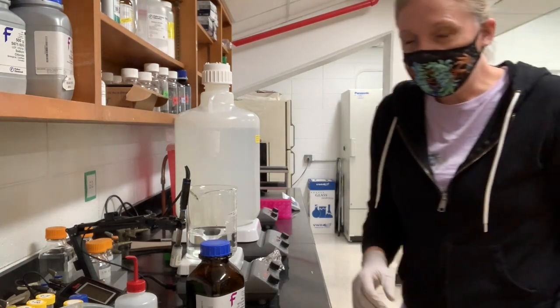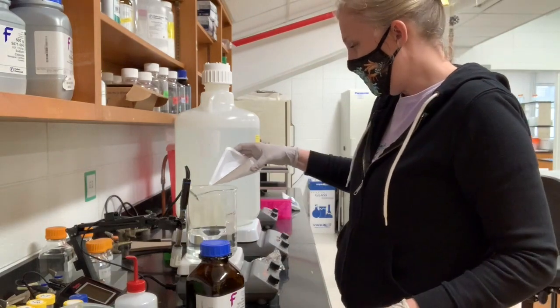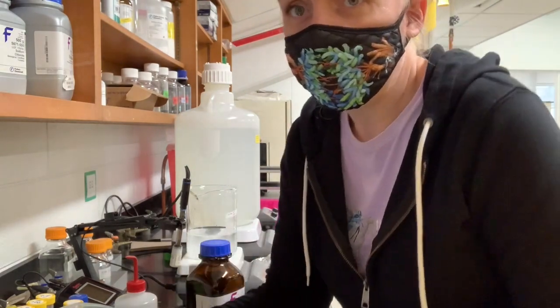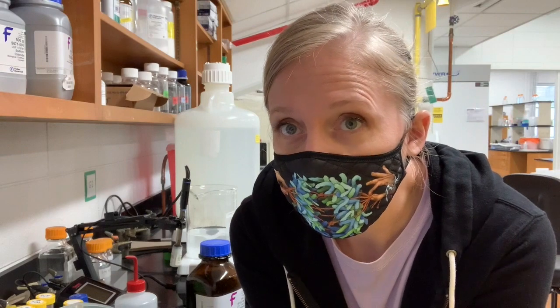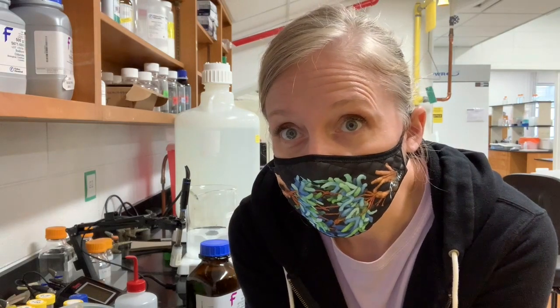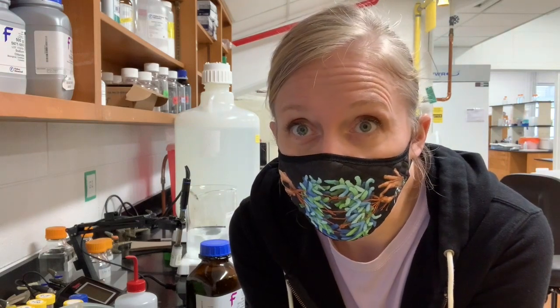A lot of people will ask, how precise do you need to be? And my response to that is that probably within a range you would have a solution that you can use. But the more precise you can be with your solution making, the more reproducible your results will be. So if you always make everything exactly and precisely as it's written, then when you go to make this solution over and over again, you'll find that your results are the same.